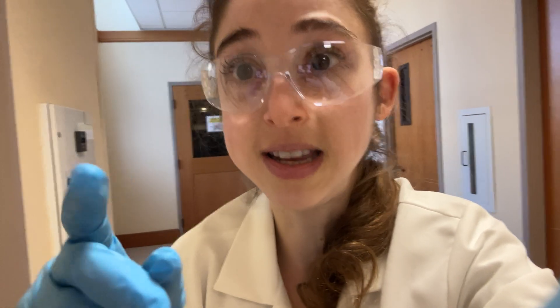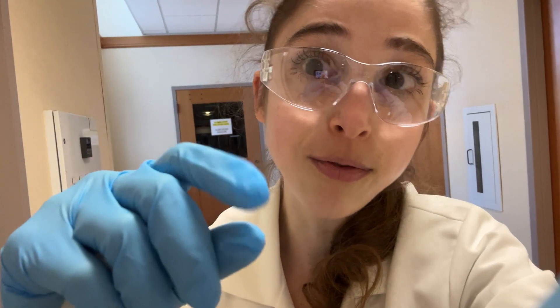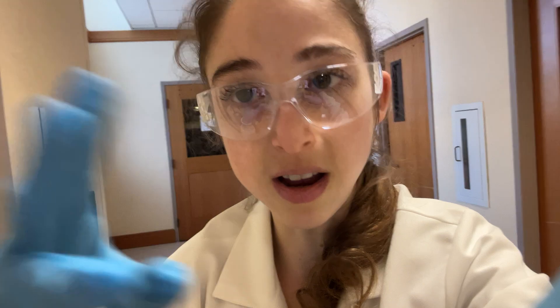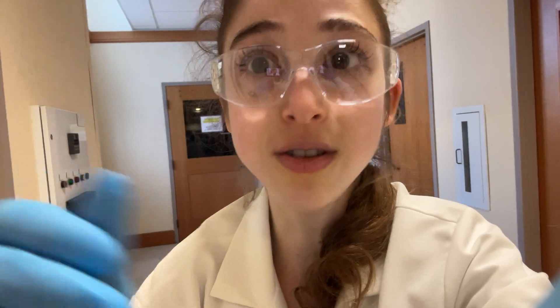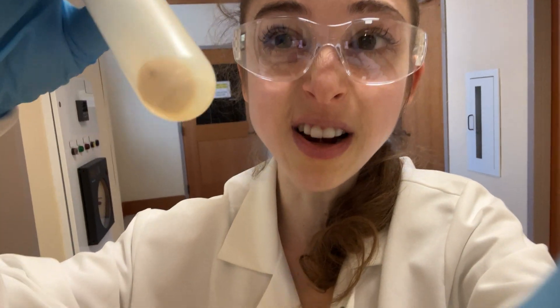Those will pellet out with the membrane fraction, which you can figure out if you run an SDS-PAGE gel - you run your lysate, the soluble stuff, and the membrane portion. If it's in that membrane portion, oh man. There's a variety of strategies you can do, so check out other posts for that. But anyway, you spin things down in the ultracentrifuge, that really fast centrifuge.